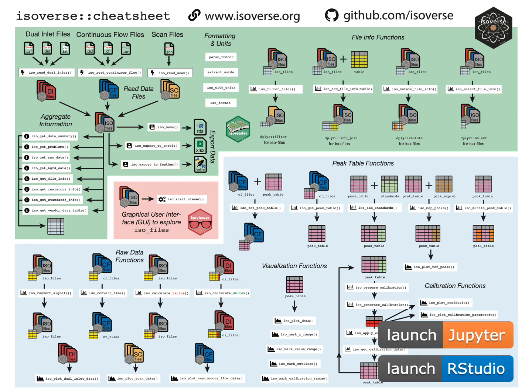Look for these launch buttons. We have implemented ways to make it easy to launch a Jupyter Notebook or an RStudio in the cloud, so you don't have to install anything locally if you want to try out functionality and just play with it a little bit.